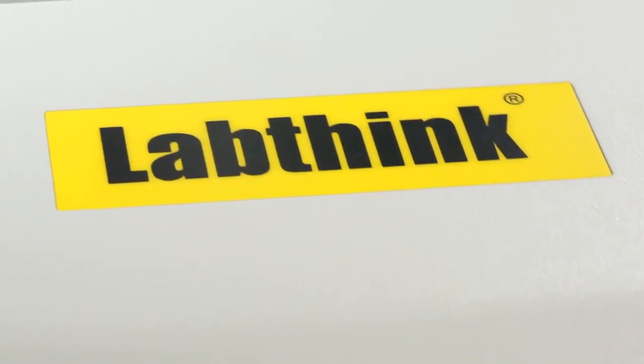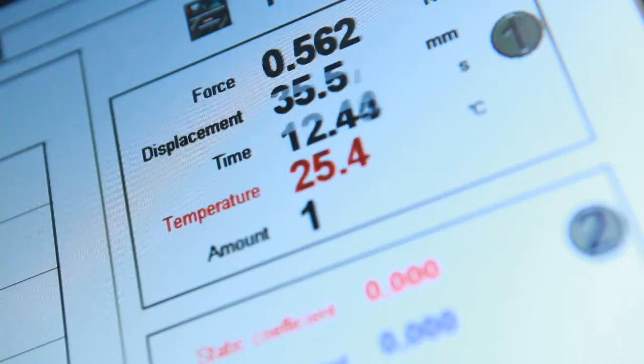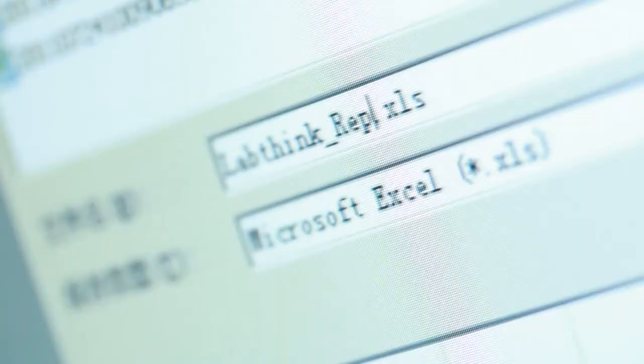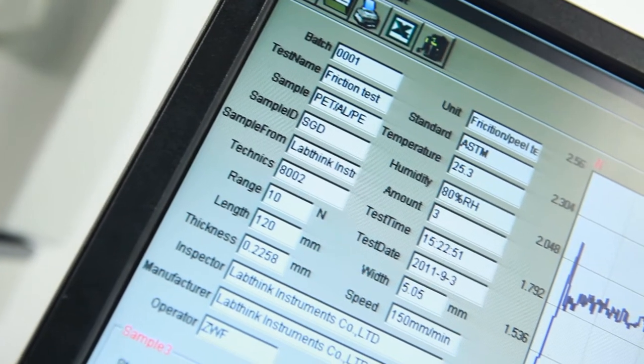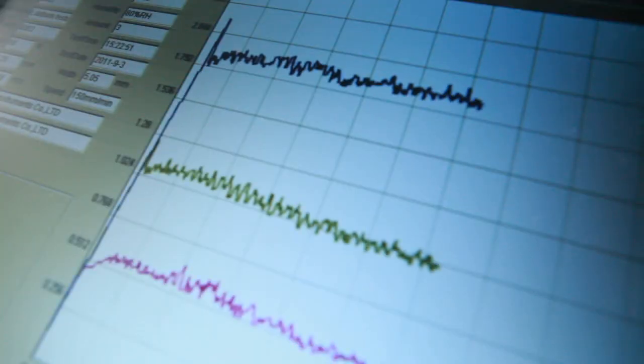The software designed by LabThink has an intuitive operation interface, visual display of real-time data and graphs, and supports data exporting in Excel format. It can also perform statistical analysis of test data and curve superposition.